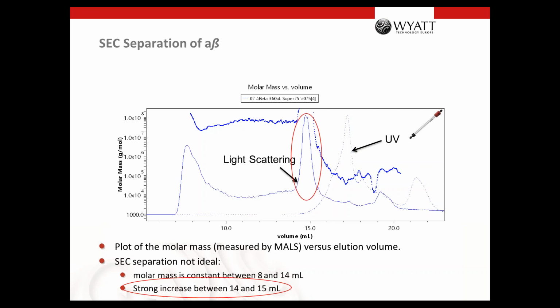And when we now look at the second detector, the light scattering detector, then we see we have the main peak in light scattering. That means a lot of aggregates elute here, or very high molar mass aggregates. And they are so high in molar mass that with this very tiny UV spectrum, we cannot measure molar mass here at all. So it just looks very strange.